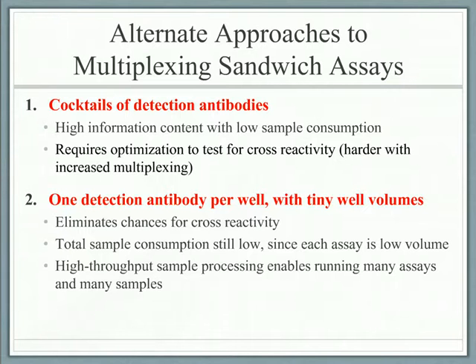So controlling for cross-reactivity becomes increasingly hard with increasing multiplexing. So we've decided to split up our assays into increasingly smaller assays, where we use smaller and smaller numbers of different assays, but the volume correspondingly decreases. When we reduce it down to maybe just a single assay per well, we don't have any concerns about cross-reactivity, but we use tiny wells so that when we use many different assays, we still haven't consumed a high volume of our clinical sample.